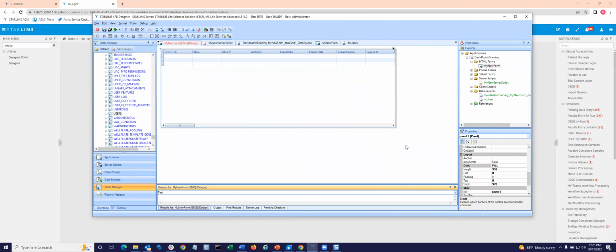So that's a brief overview of how the system actually works and what it looks like from the design aspect. I'm going to open up the floor for questions and we can go through as many exercises as you'd like. Anybody? So if no direct questions, does anyone have any comments?